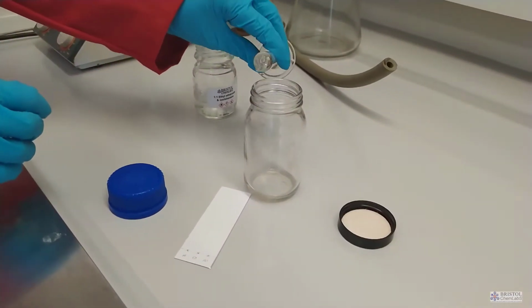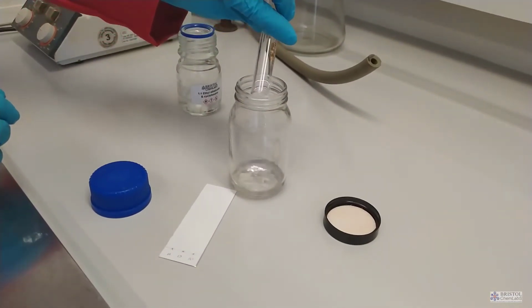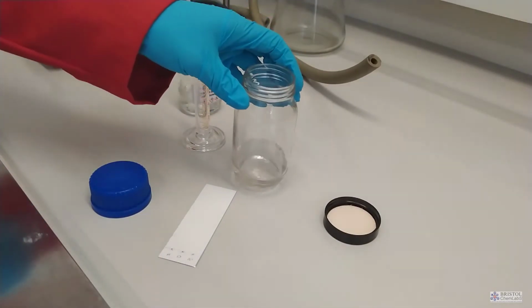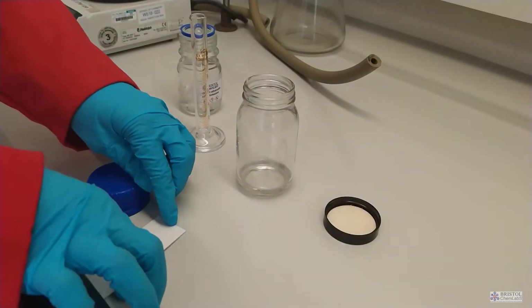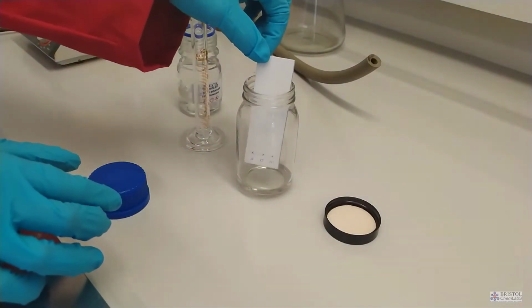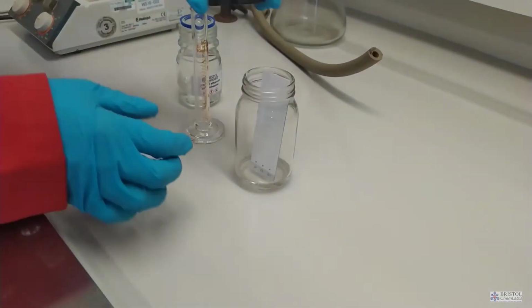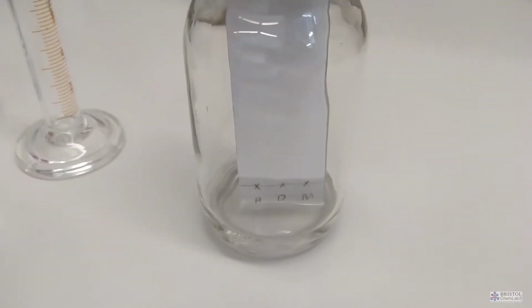After a while, the solvent mixture passes up through the alumina of the TLC plate, and depending on the intermolecular bonding of your samples, it will progress up the plate at different rates. And we stop the TLC before the solvent front gets to the top of the plate.